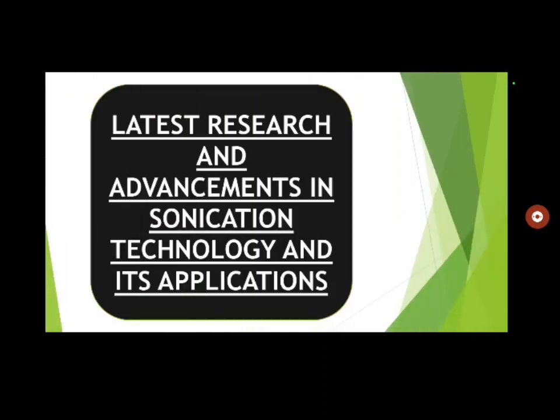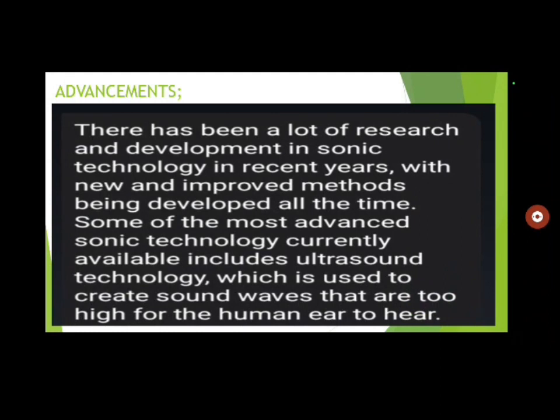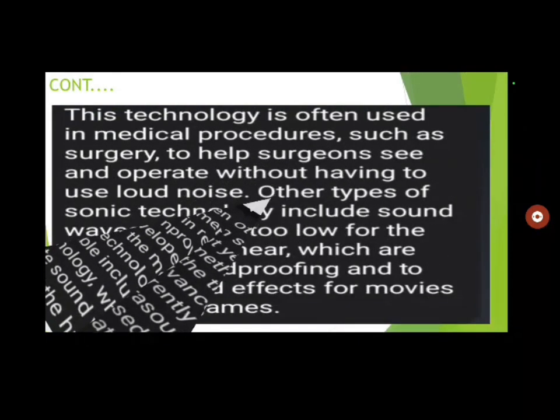Now the latest research and advancements in sonication technology and its applications. Advancements. There has been a lot of research and development in sonic technology in recent years, with new and improved methods being developed all the time. Some of the most advanced sonic technology currently available includes ultrasound technology, which is used to create sound waves that are too high for the human ear to hear.